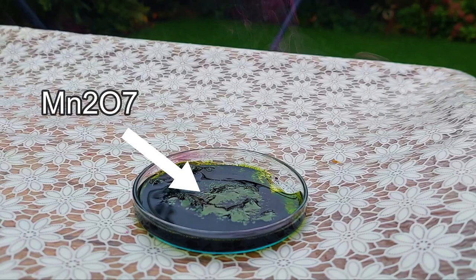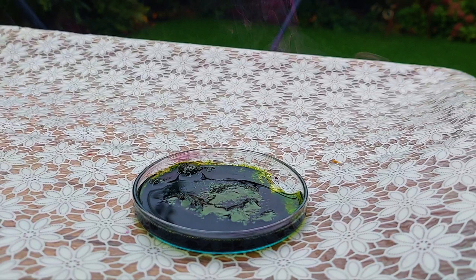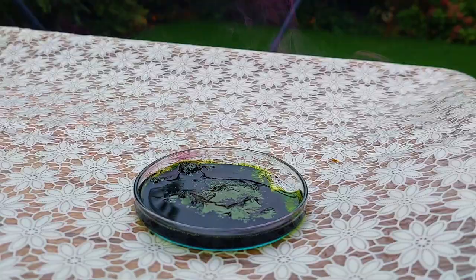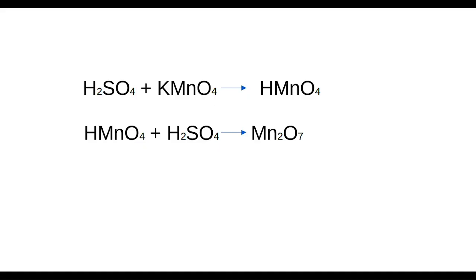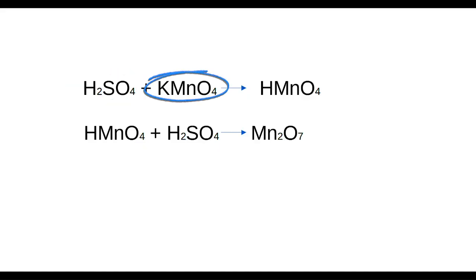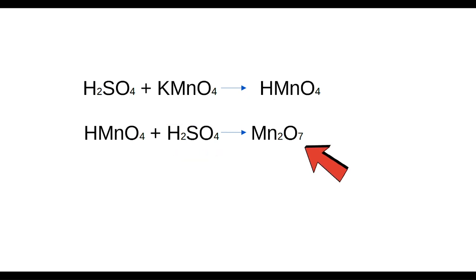The green oil that you see on the top is manganese heptoxide. Let's talk a little about its formation. Sulfuric acid reacts with the permanganate to make permanganic acid. This acid is then dehydrated by sulfuric acid to produce our permanganic anhydride, or manganese heptoxide.